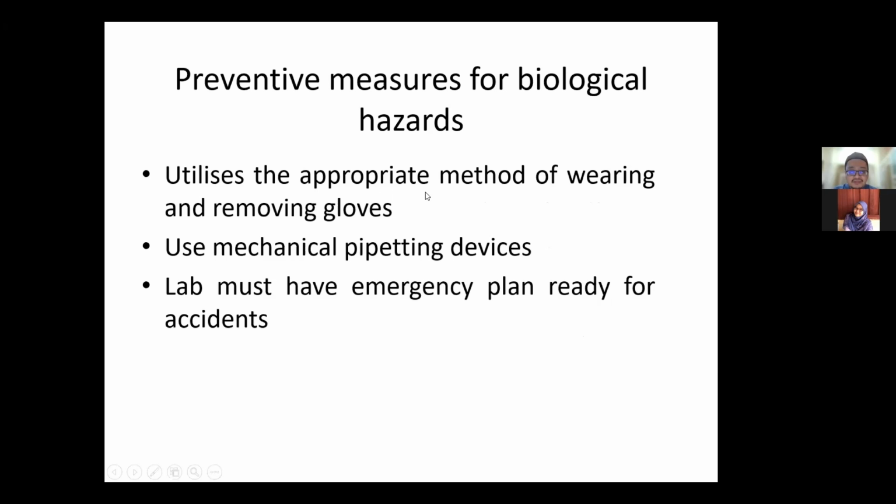Okay, other preventive measures for biological hazards. Utilize the appropriate method of wearing and removing gloves. This one I will demonstrate. We do not just throw them away. There is a way so that you don't touch your skin using the glove. Then use mechanical pipetting devices. The lab must have an emergency plan ready for any kind of accidents.